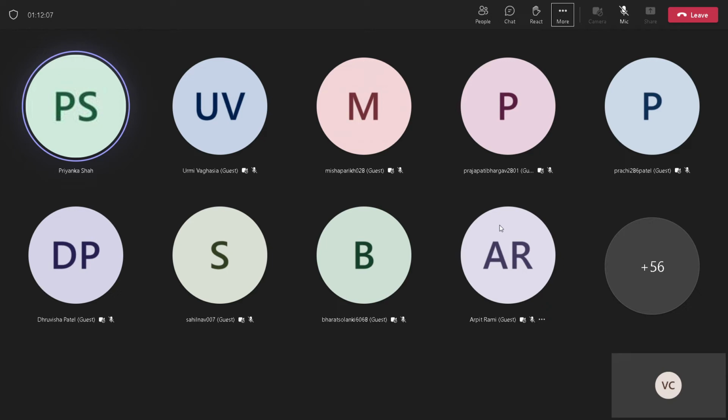But for visualization of dye spotting, no method is required, because the dye itself has some color, so you can easily identify at which particular distance each dye has migrated on the TLC plate.